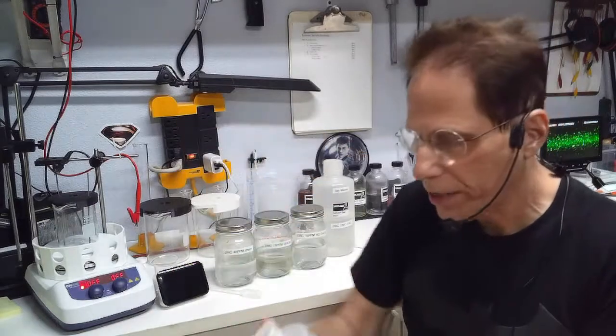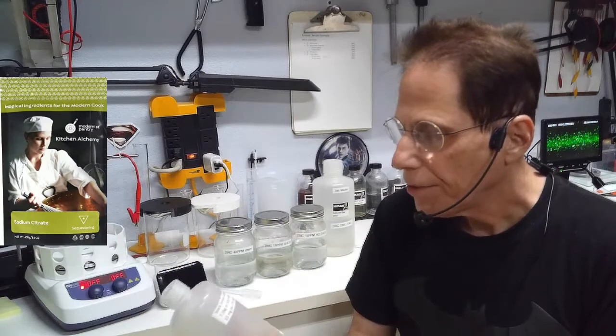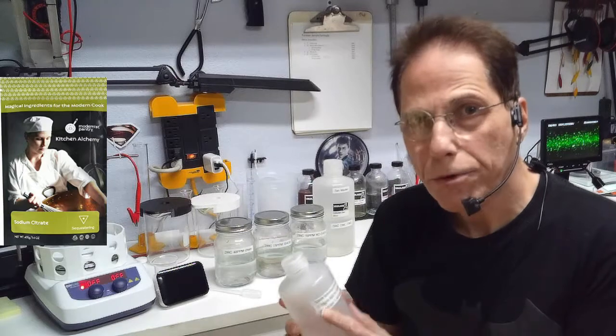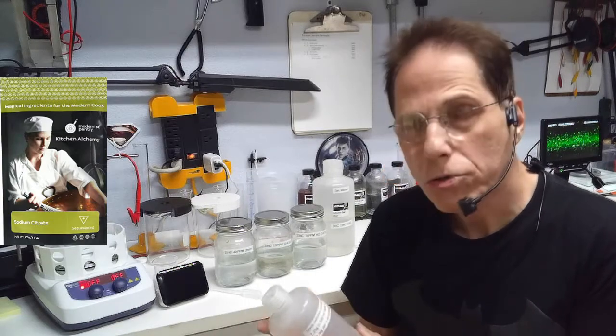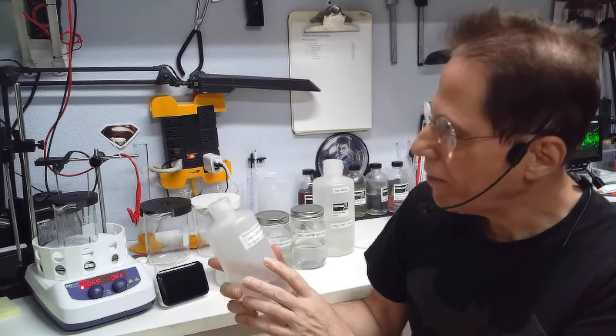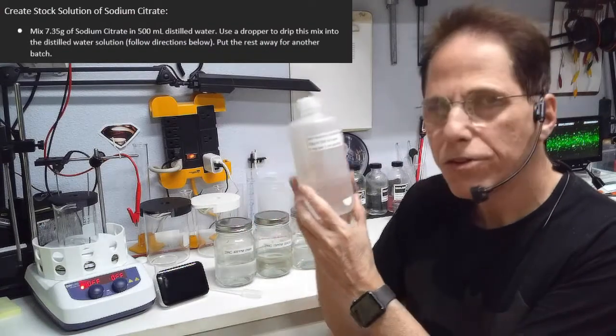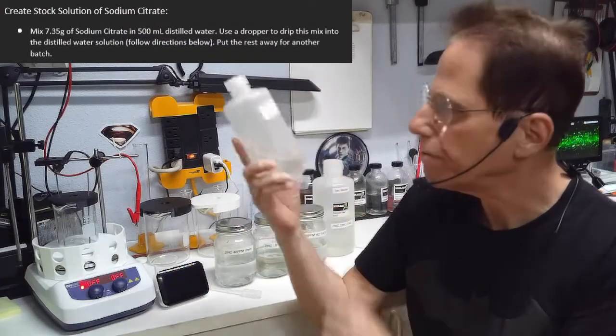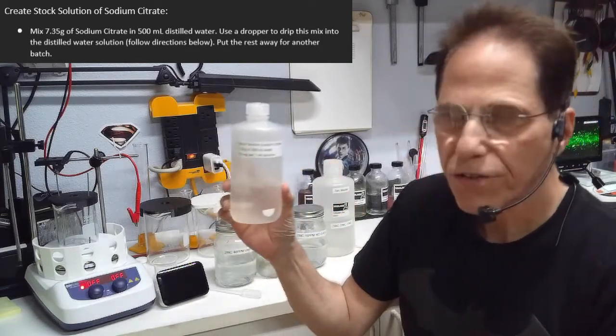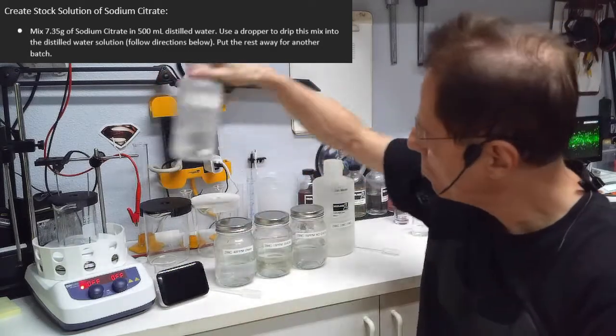We're going to have to create what's called a stock solution using sodium citrate. This stuff isn't going to go to waste, so you'll use it with copper as well and also with gold. You're going to have to mix about 7 grams of sodium citrate in 500 milliliters of distilled water.